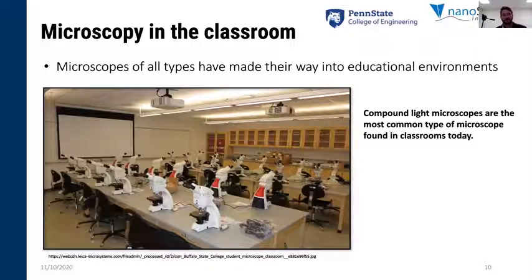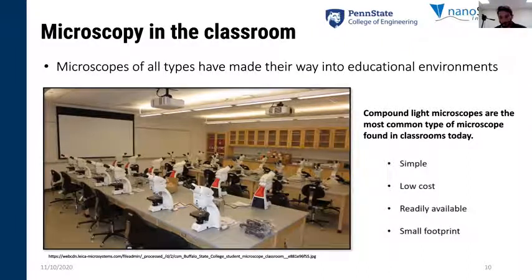So microscopes of all types have made their way into educational environments. This is nothing new, right? Here you can see compound light microscopes on every desk in a science lab. These are the most common microscopes used today, and there are a lot of reasons why. They're simple, they're low cost, they're readily available, and they're small, right? You can fit one on every desk.